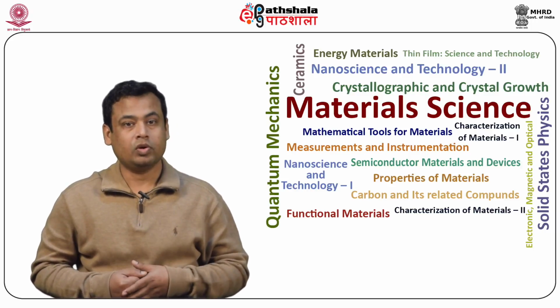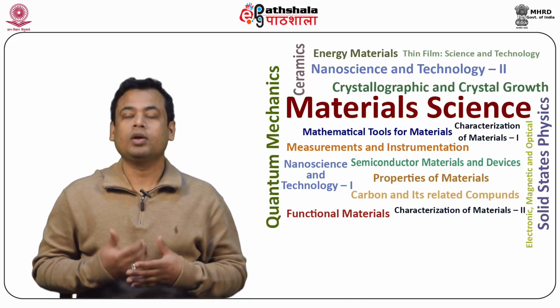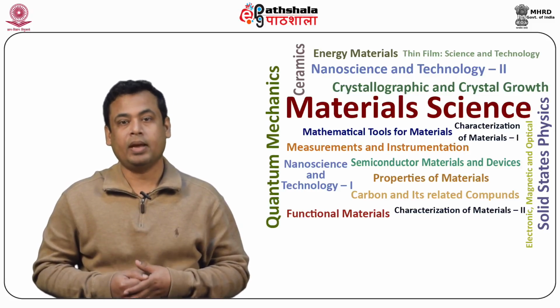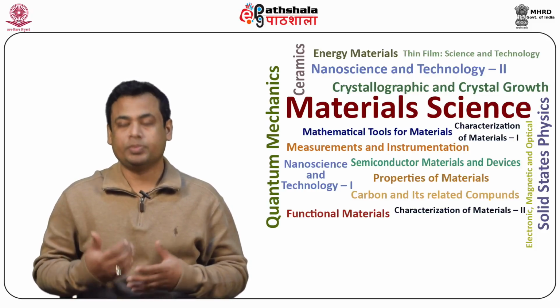In this lecture, we will discuss the properties of the individual components in a spectrofluorometer and how these properties affect the observed spectral data.